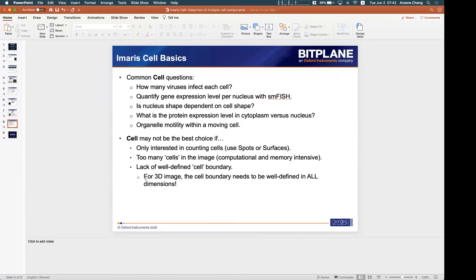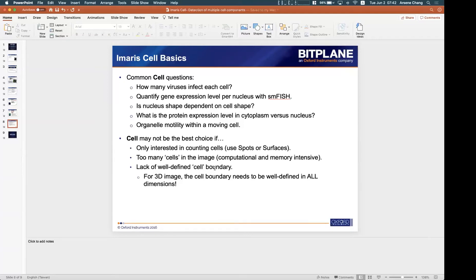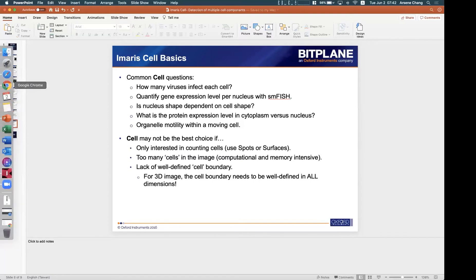And the third one, I think this is one of the most important: if you are staining lack of well-defined cell boundary, especially for 3D images, then this cell detection may not be successful. What I mean by well-defined cell boundary, I can give you an example.